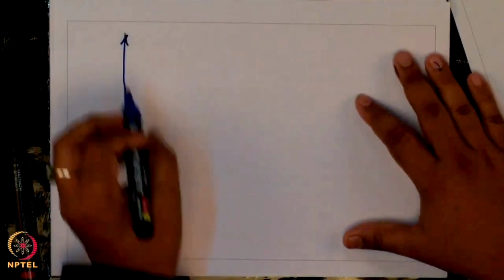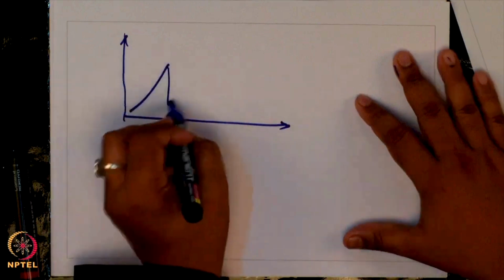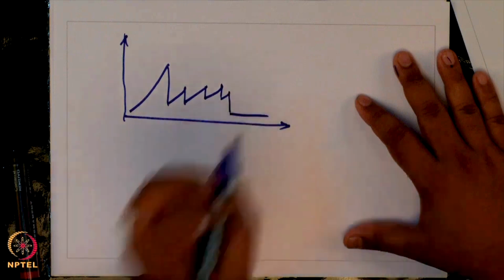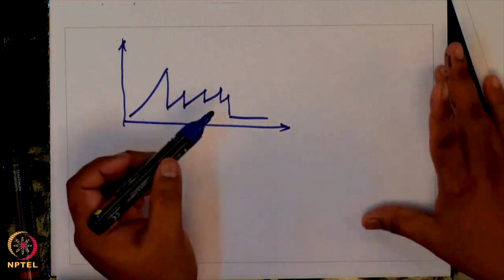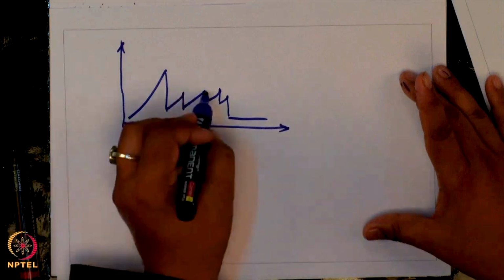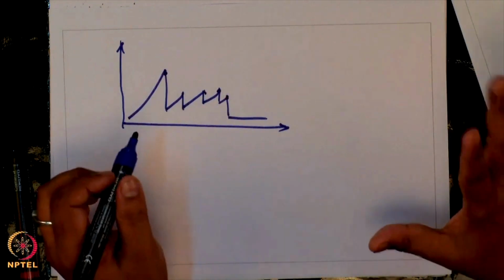One by one, if I were to draw the sawtooth profile, one by one, okay. So, I have just drawn 3 peaks. In this particular case, for our imaginary protein with 3 domains, you have 3 peaks plus 2 additional peaks here for one particular situation.